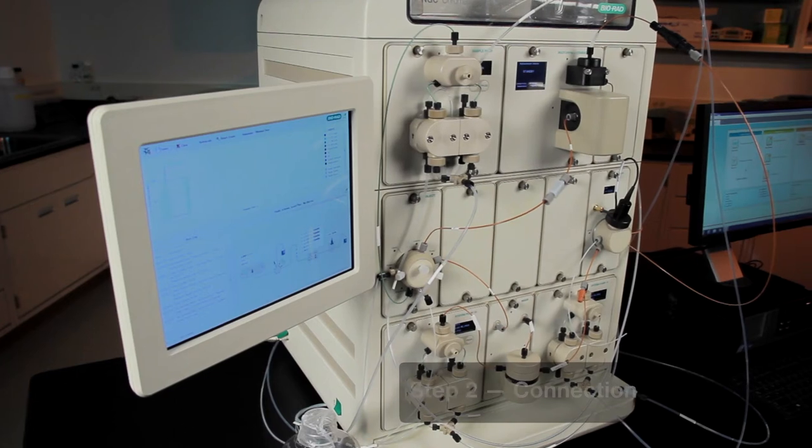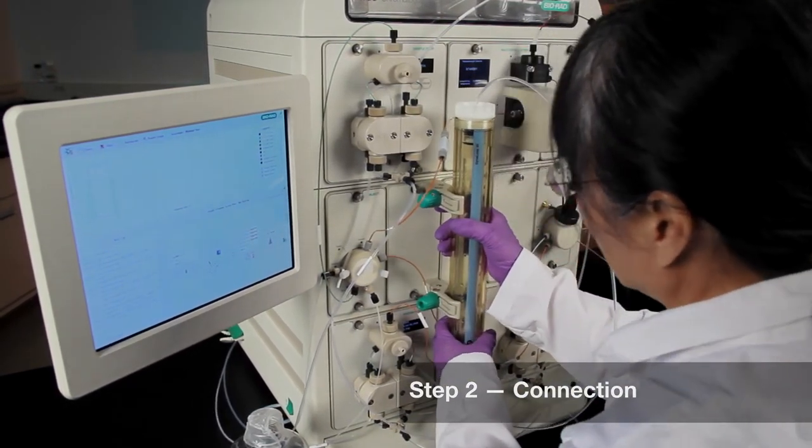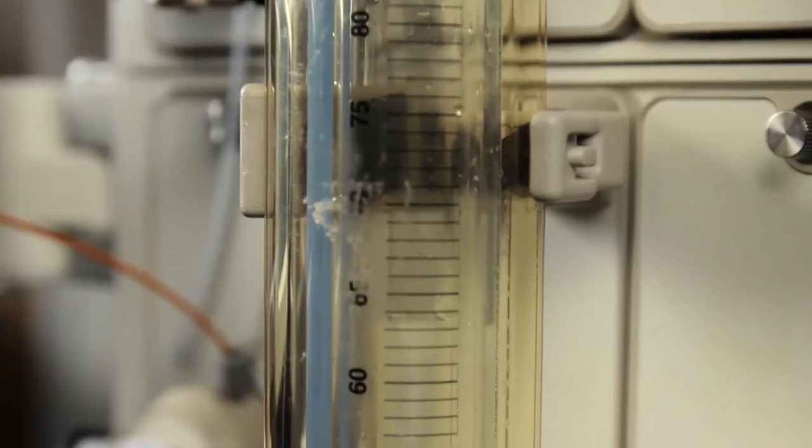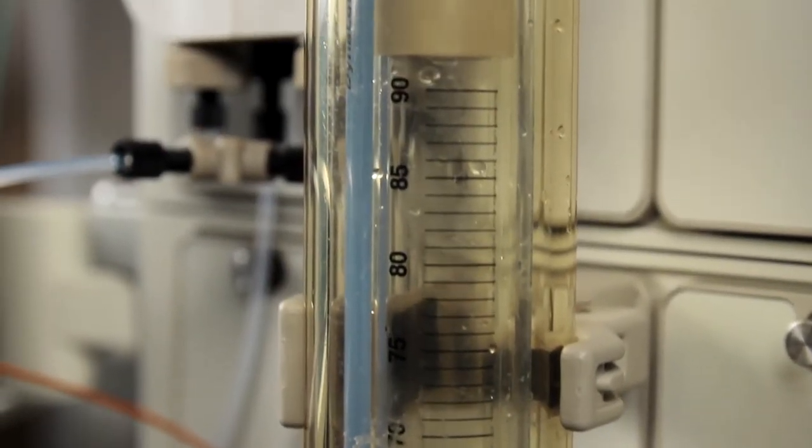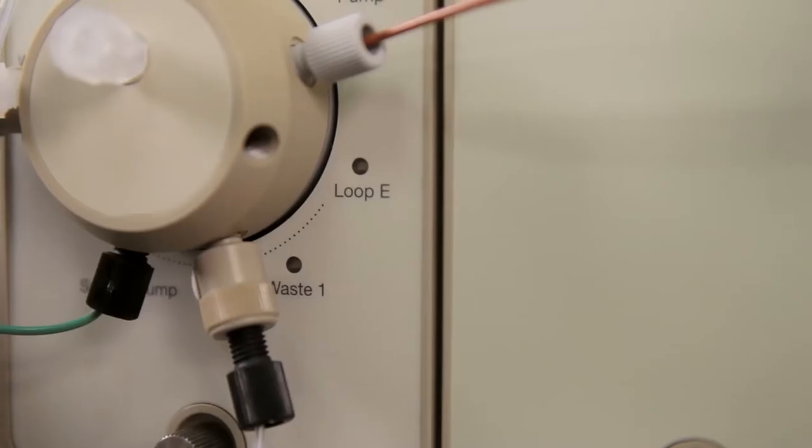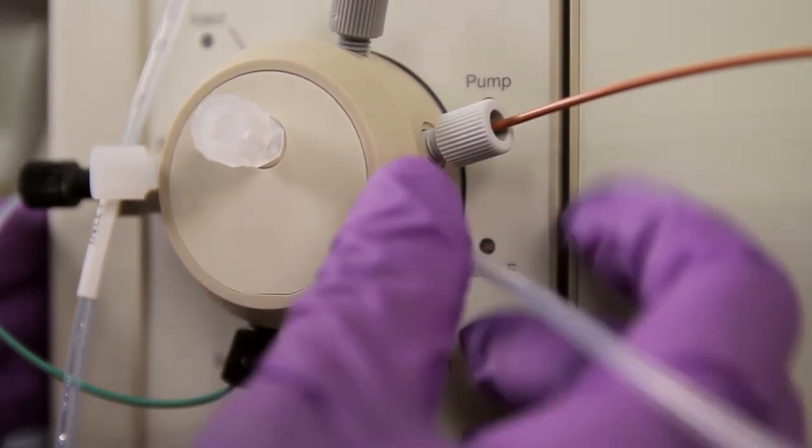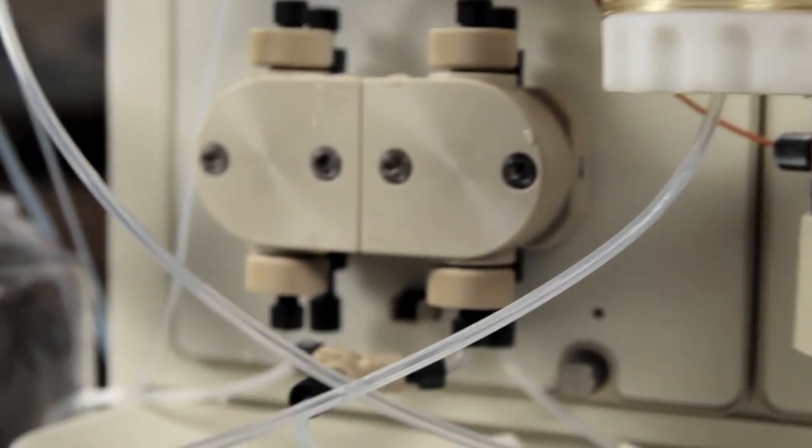For Step 2, we will connect and prime the Dyna Loop using the NGC system. The NGC should be primed with buffer and water. Assemble the Dyna Loop so the sliding seal is at the higher volume mark and attach to Loop E of the injector. Leave the 0 mil end free to waste.